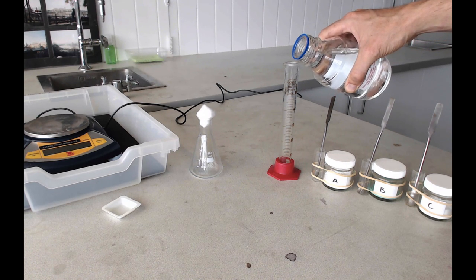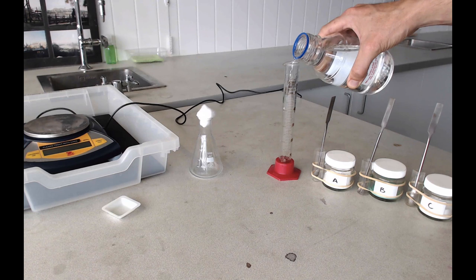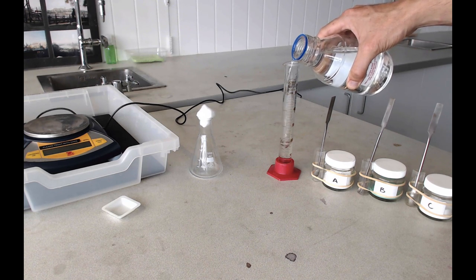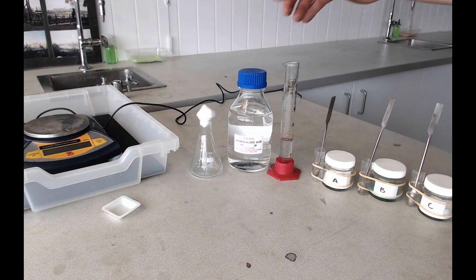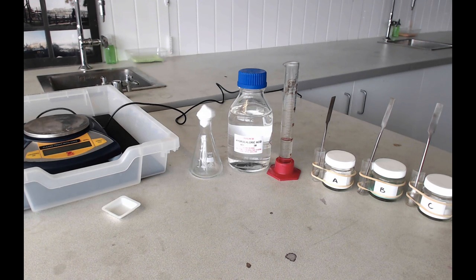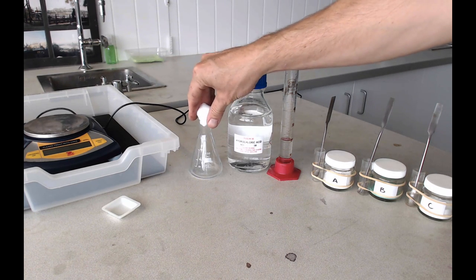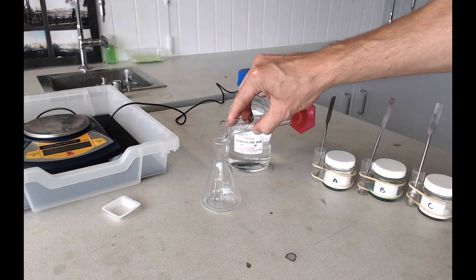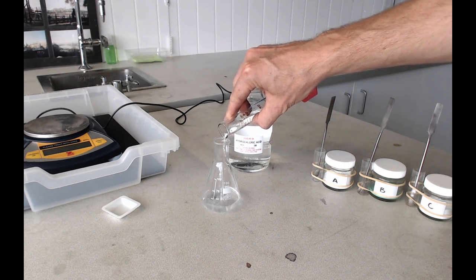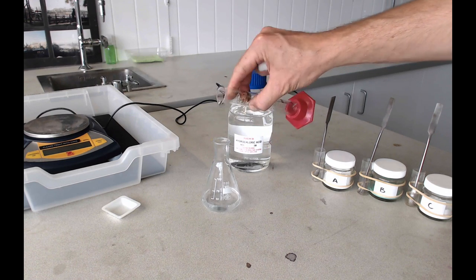About 20 ml, but it's not essential to be very precise about this. If you take a little bit more or a little bit less, that's absolutely fine. Once you've got your acid in your measuring cylinder, you can pour it into your conical flask. Remove the cotton wool plug and pour all that acid into your conical flask.